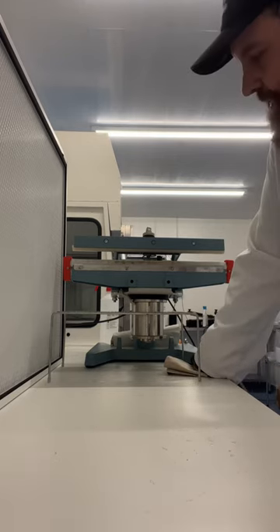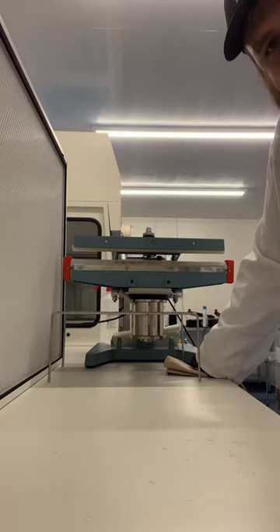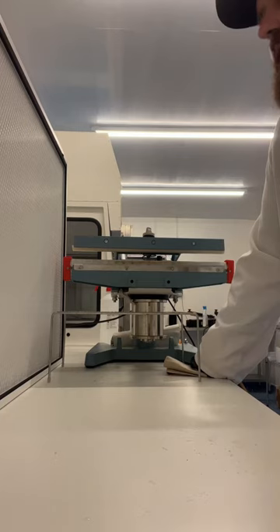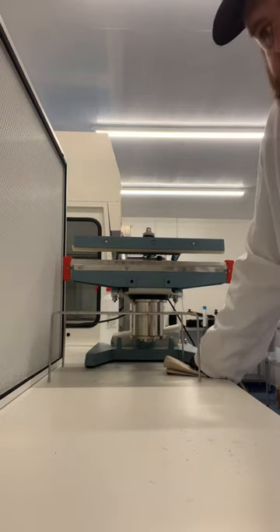Obviously I've got the flow hood off at the moment. Normally we run it for about 10 minutes just to dislodge any particles or bits that might have gotten into the filter or settled in there while it's been off — not that it's off that often.